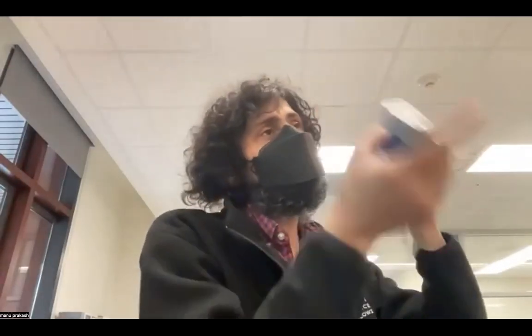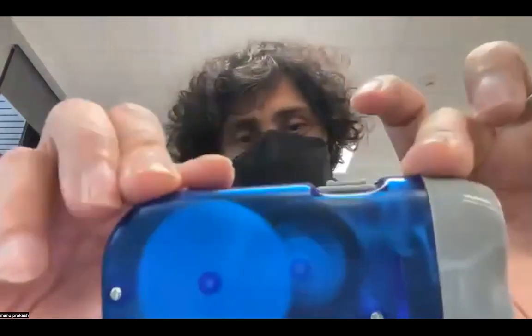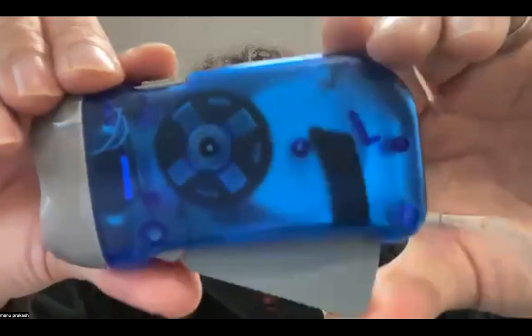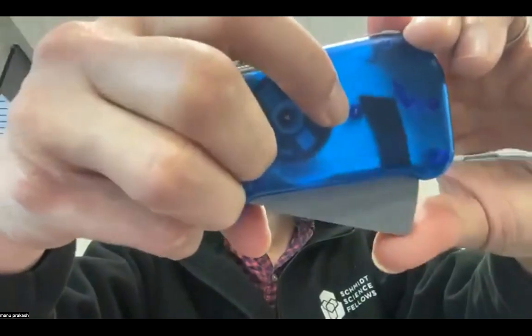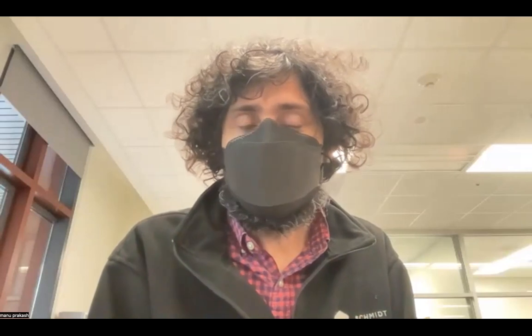But now, if you rotate it the other way, they fling out the other way and then they don't engage with the gears. And that's why they can act as a kind of one-way mechanism, although my input here, for example, is going in both directions, because this first gear is going back, forth, back, forth. The final output gear is only going in one direction. It's not very efficient as a mechanism, but the reason to broaden that out with all kinds of mechanisms is that for different types of tests, different things are needed.